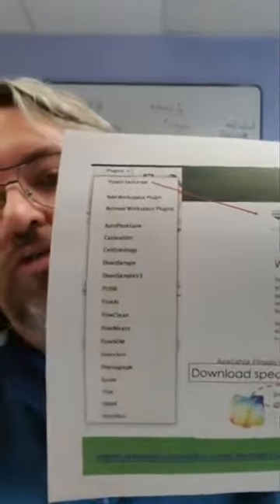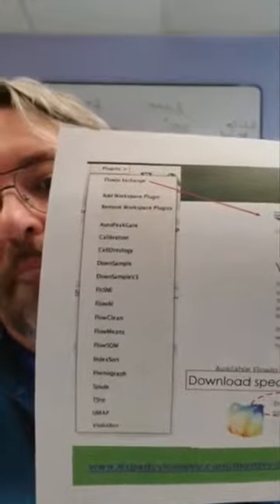Now, to get all the other packages, under the FlowJo plugins menu, you can go here to the FlowJo Exchange, and you can see that here. This is a website, and this is just showing you a capture of that. You can either download all the files or download a specific plugin that you might want to use. These include things like tSNE, SPADE, FlowSOM, there's a cell ontology, FlowClean, and my new favorite program, FlowAI.